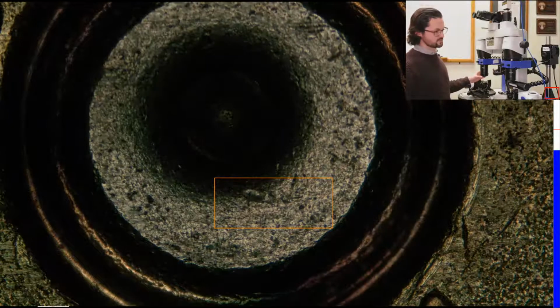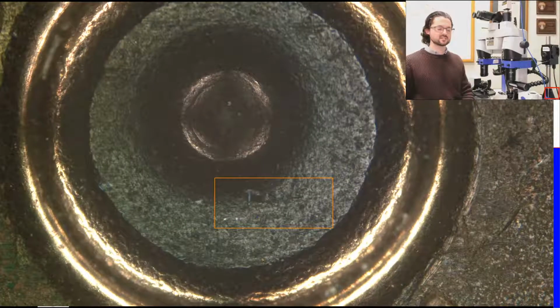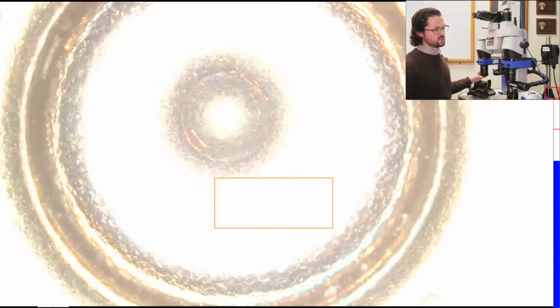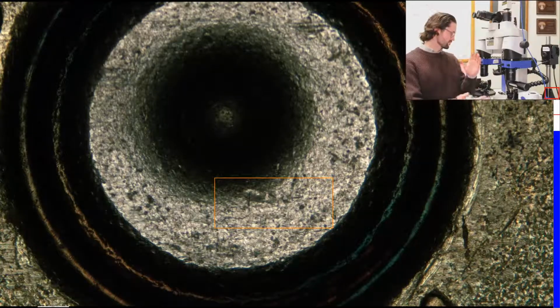You could also turn it to its darkest position. You'll see how the screen's getting darker and the camera's fighting to compensate. This just turns your coaxial system into reflected light pole. So that's something just to know, that when in usage, you rotate this quarter wave plate compensator until it gets to its brightest position. So that's the coax.